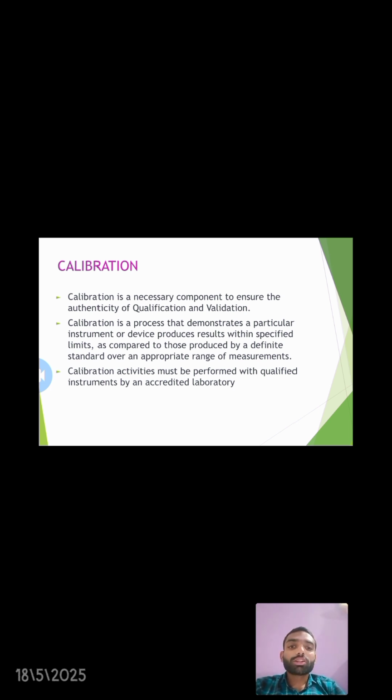Calibration is a process that demonstrates that a particular instrument or device produces results within specified limits as compared to those produced by a definite standard over an appropriate range of measurements. Calibration activities must be performed with a qualified instrument by an accredited laboratory.